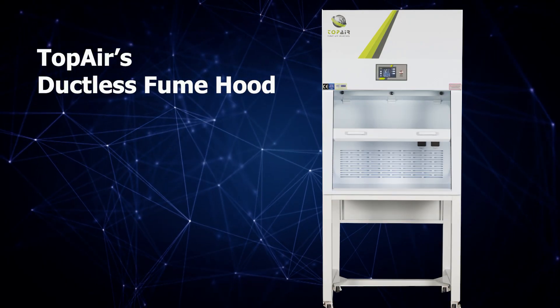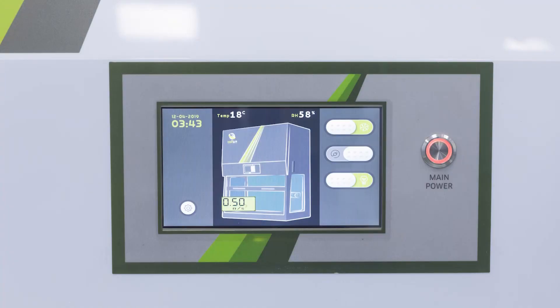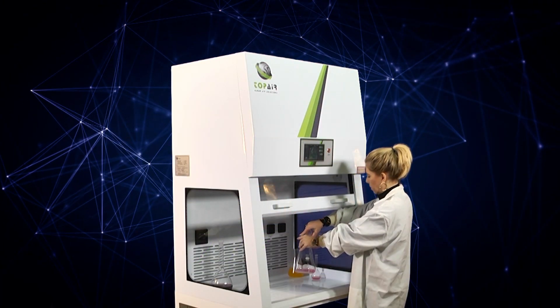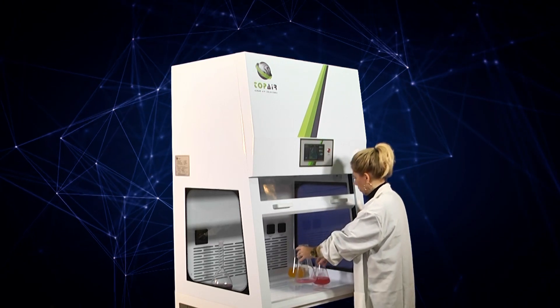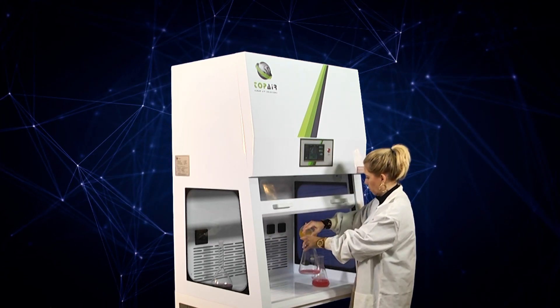Top Air is proud to introduce a series of innovative ductless fume hoods with high-end control systems, EC fans, and color touch screens for all models. As an independent portable unit, the ductless fume hood removes chemical fumes from the workspace, recycles and channels back the clean air.